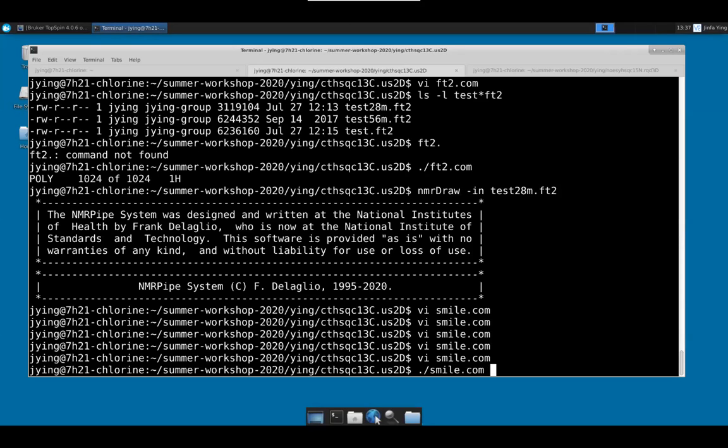We could always run longer, for 150 milliseconds. With decoupling, of course, you have to be a little bit careful. Yeah. So you could do that, or in some cases for large proteins, 60 milliseconds is more than enough. You acquire, for example, 100 milliseconds of acquisition time.